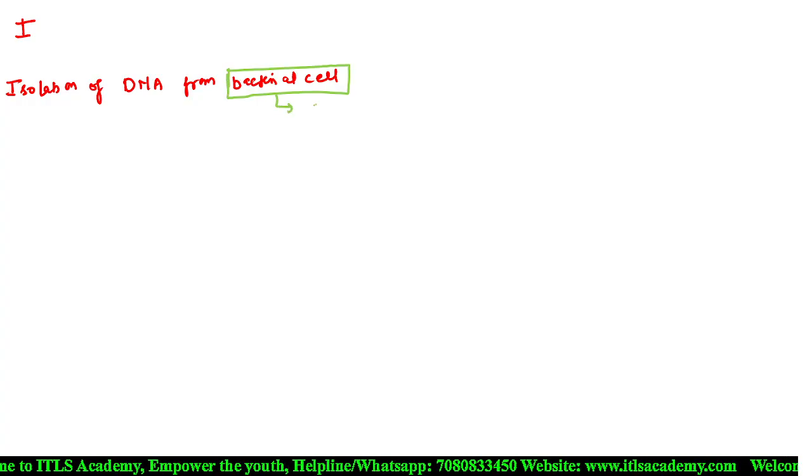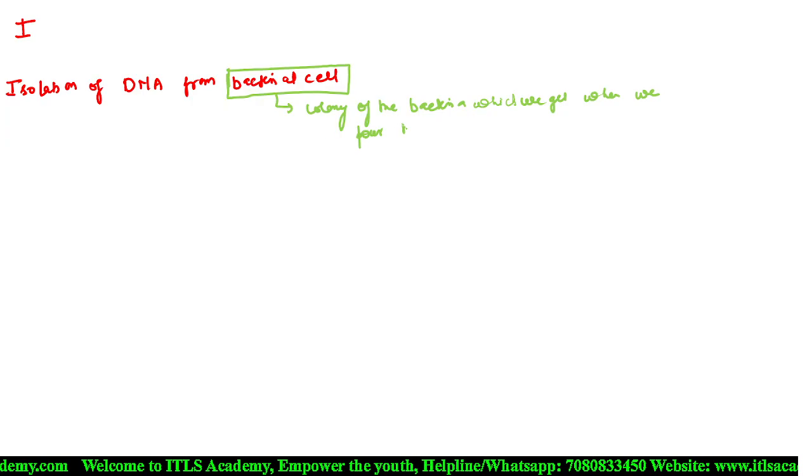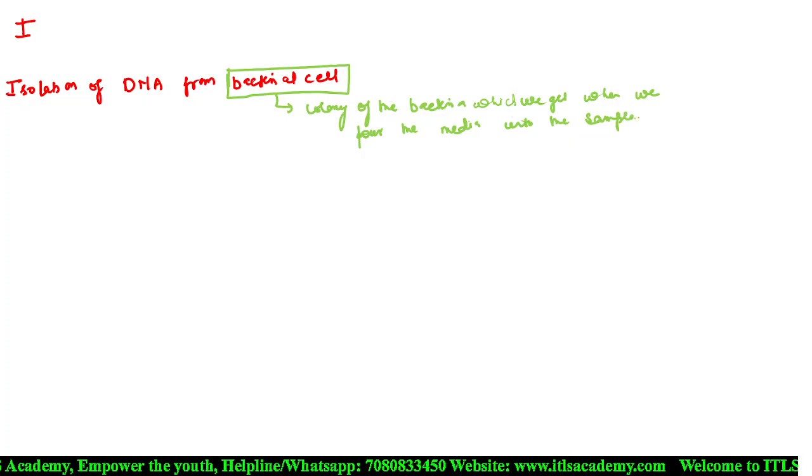These bacterial cells are the colony of the bacteria which we get when we pour the media into the sample, after 48 hours.